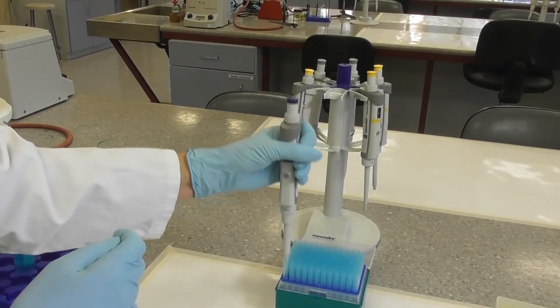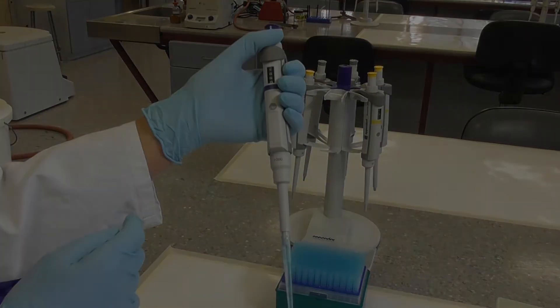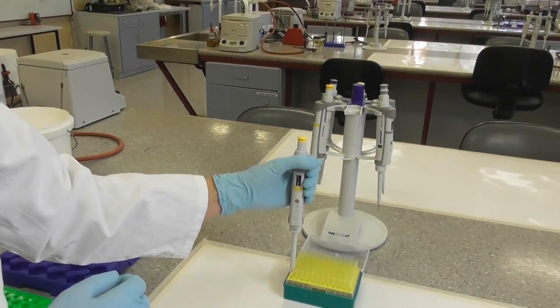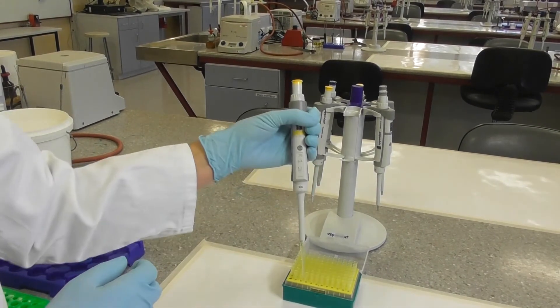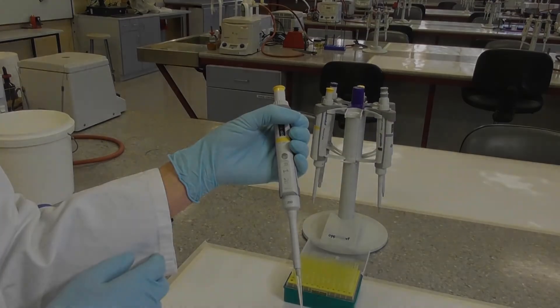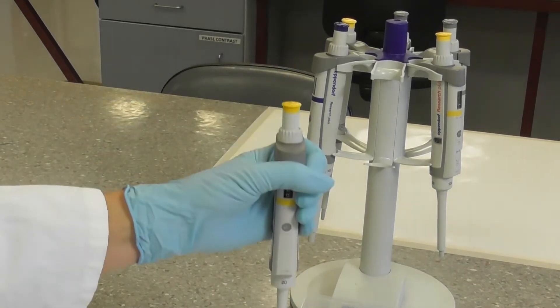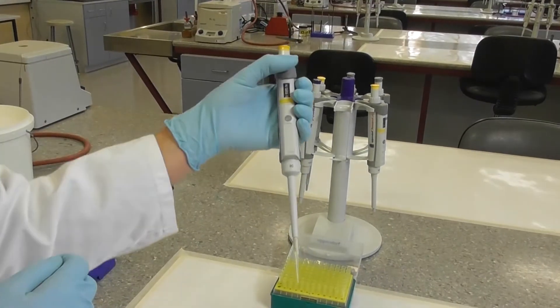The 1000 microliter pipette uses the large boxed tips. The 200 microliter pipette uses the medium sized boxed tips. The 20 microliter pipette also uses the medium boxed sized tips.